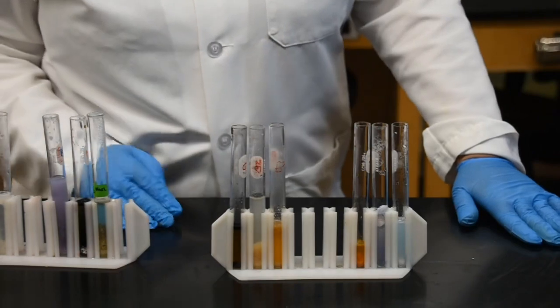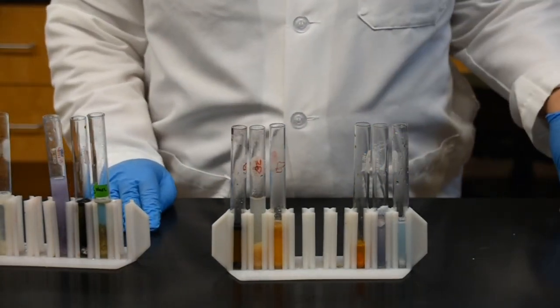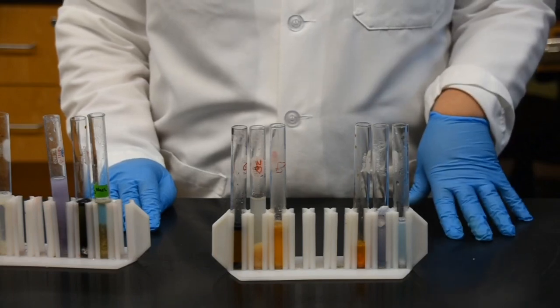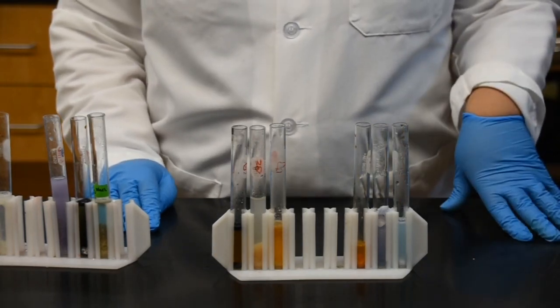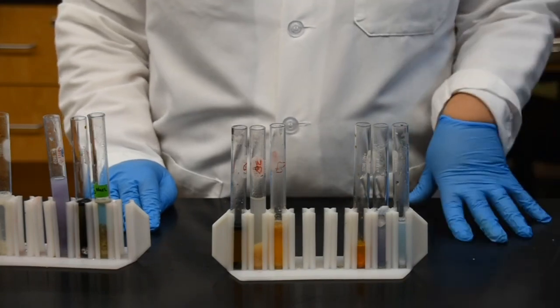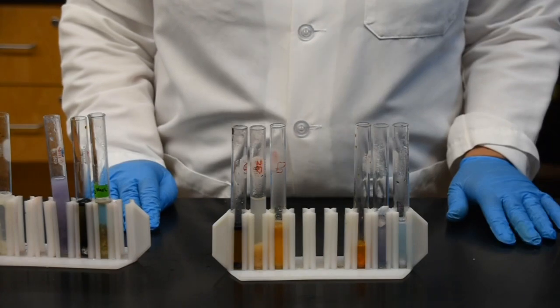So you should have your lab activity in front of you and write the name of the food sample. And on the first table that you have, you should be able to write down the colors that we have here, and then I'll talk about the second table later on.